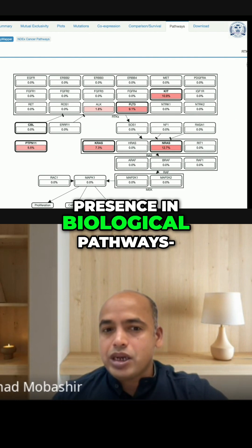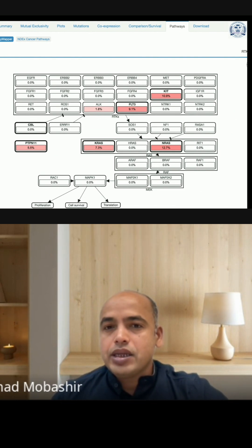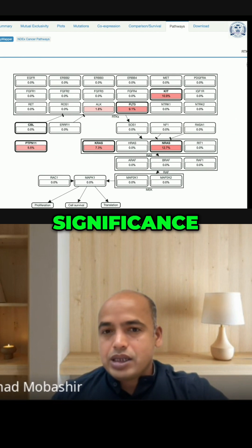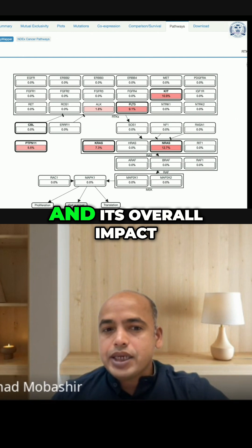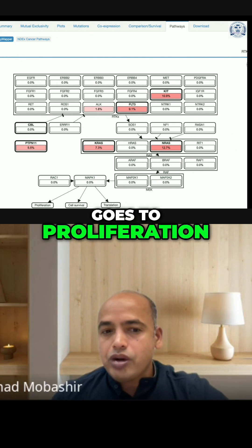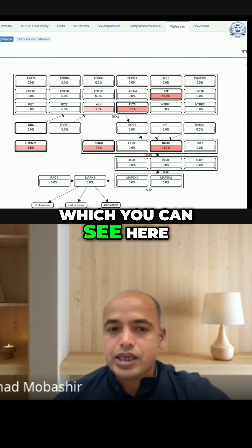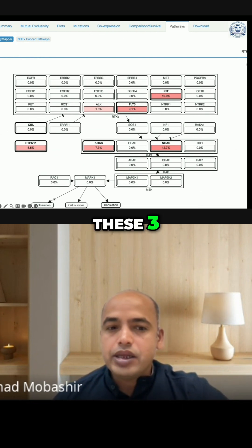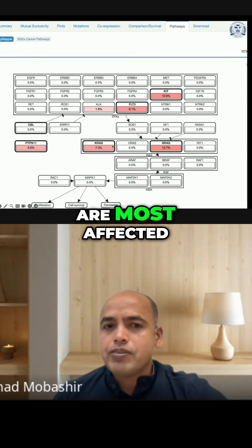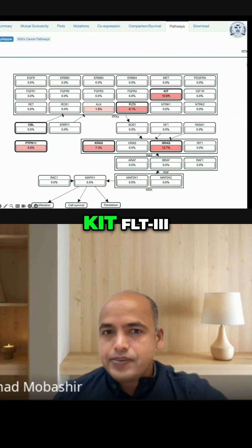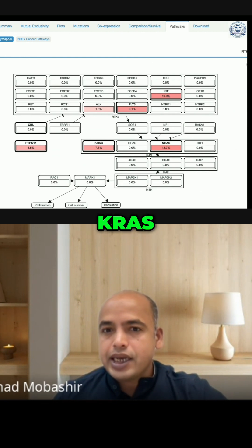This is followed by their presence in biological pathways. Here you can see the highest significance pathway for the selected genes and its overall impact, which goes to proliferation, cell survival, and translation. The genes most affected are KIT, FLT3, PTPN11, KRAS, and RAS.